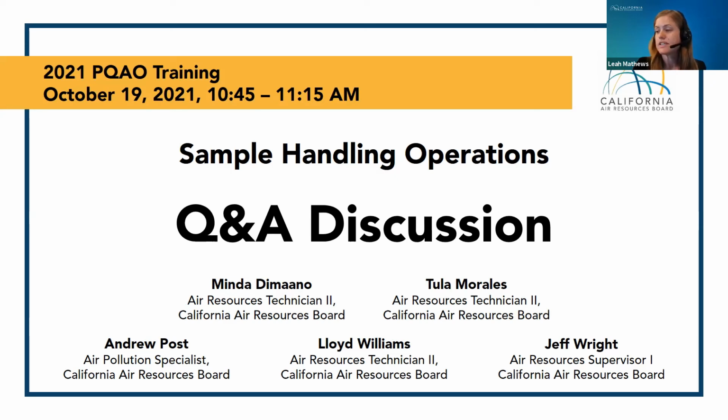Has there been any consideration for digital files for chain of custodies? Well, I'm part of the LIMS team, and we've thought about that idea. It would be much further down the line if we go that way. Nothing planned at the moment.